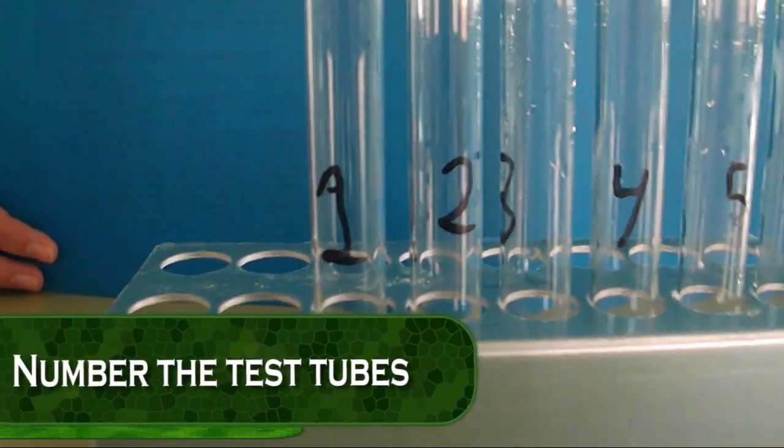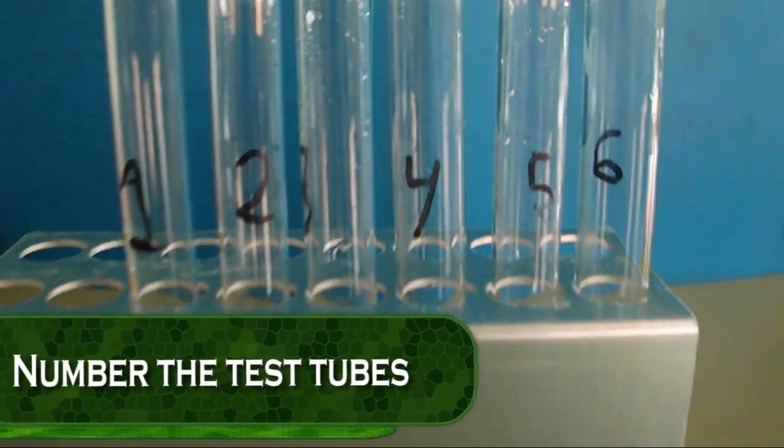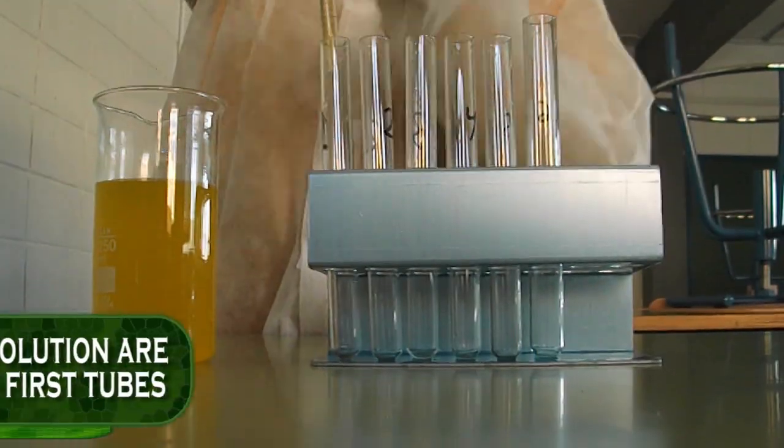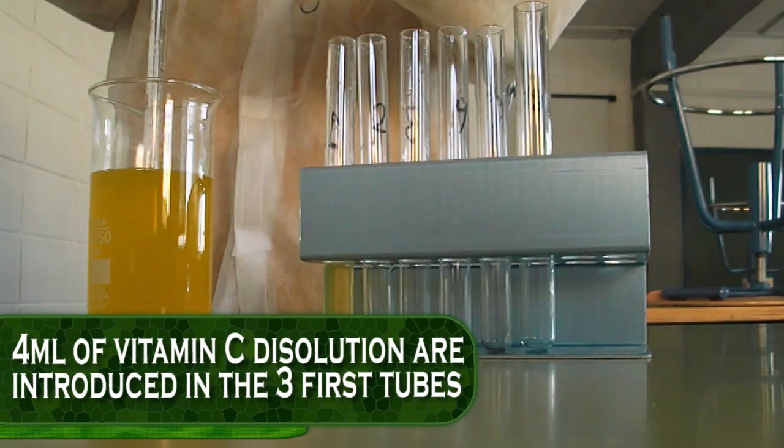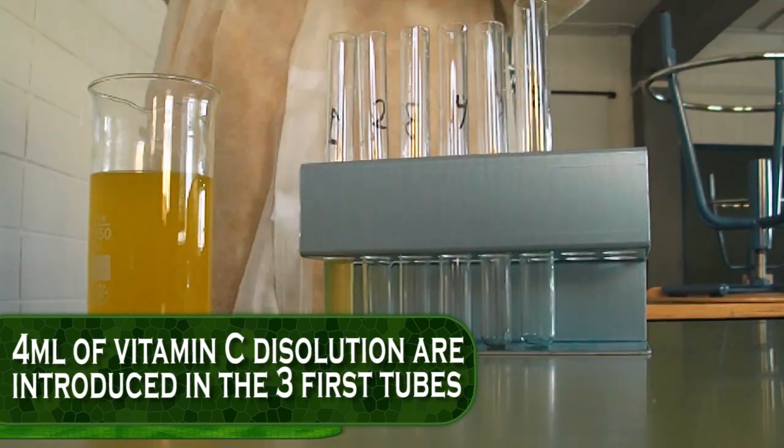First of all, the six tubes are numbered with the marker. 4 ml of vitamin C dissolution are introduced in the three first tubes.